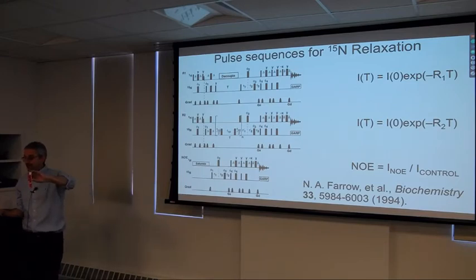And back when we talked about the secular approximation, we said the spins weren't so smart. We could think they had a frequency, 2 Z magnetizations, NZ and HZ. We can make these two non-secular. They're normally secular because they're both Z, but we can make them look non-secular by flipping one upside down periodically.